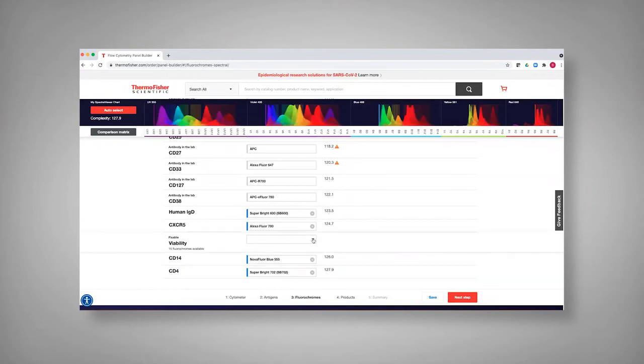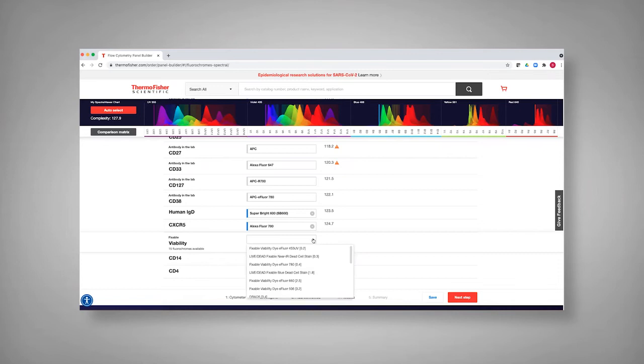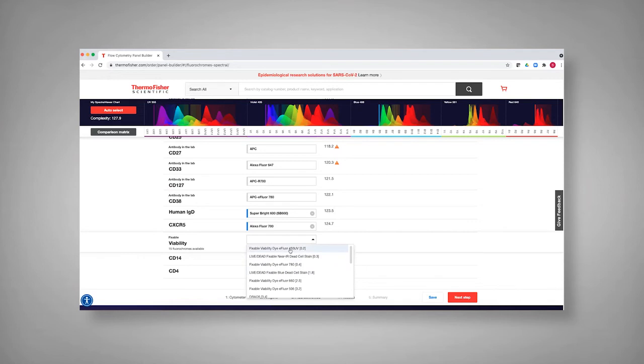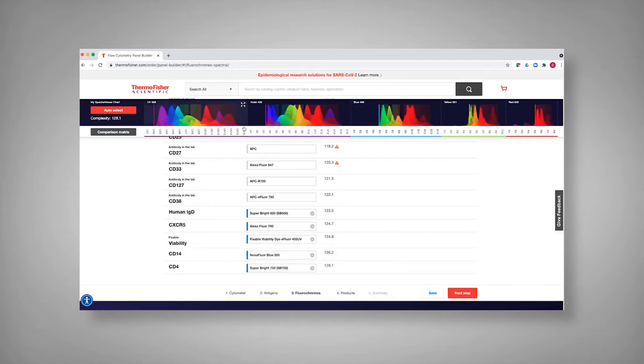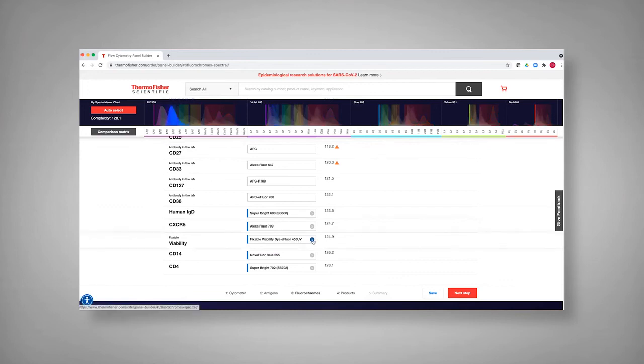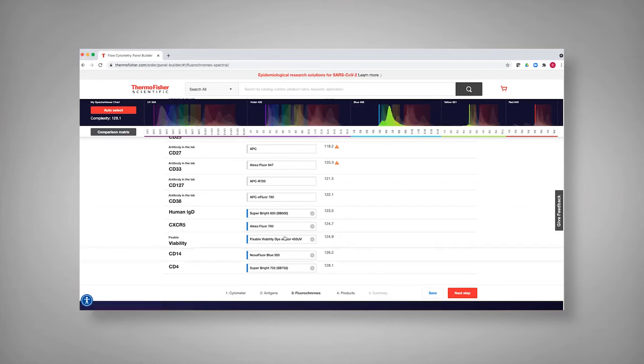The one thing it has not done is picked for the viability dye. So you can also look at what's available. So in this case, for instance, we were using the live dead blue in that previous panel, you could also use this other fixable viability dye that adds less complexity to the panel. But again, you still want to keep evaluating what you're looking at. And so you can continue to make those decisions as you go through.